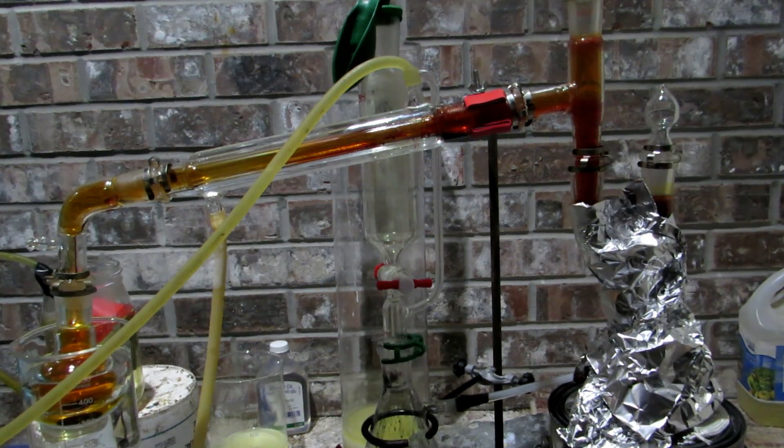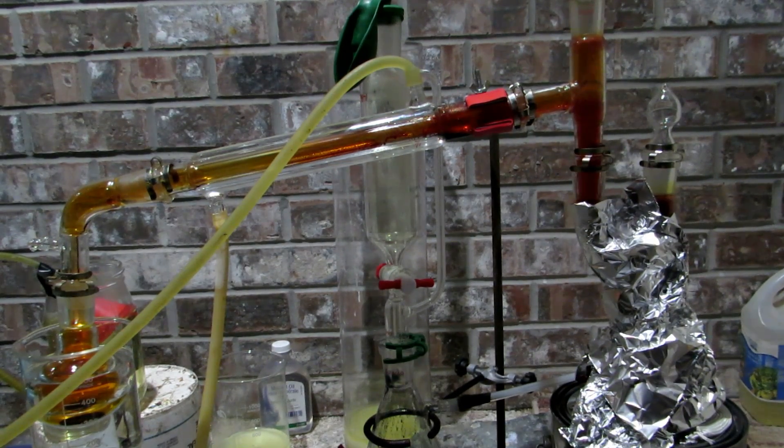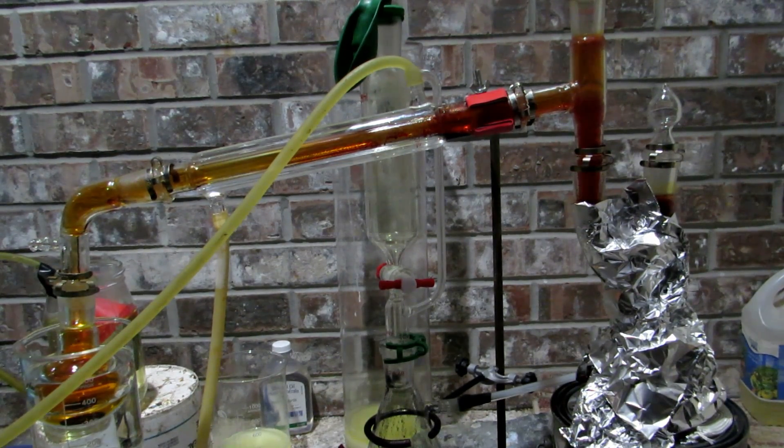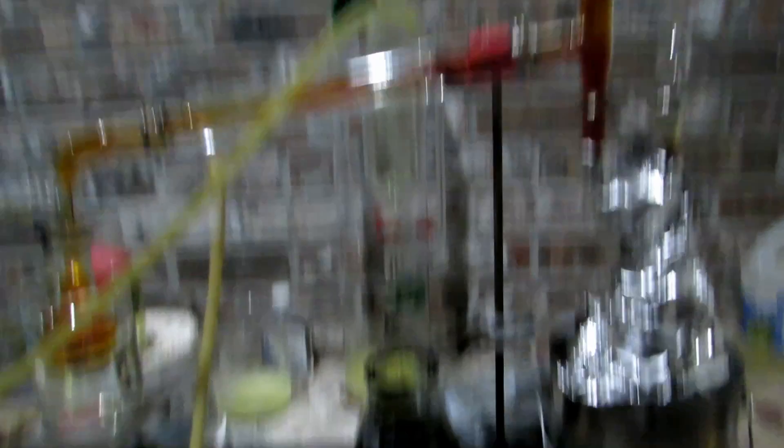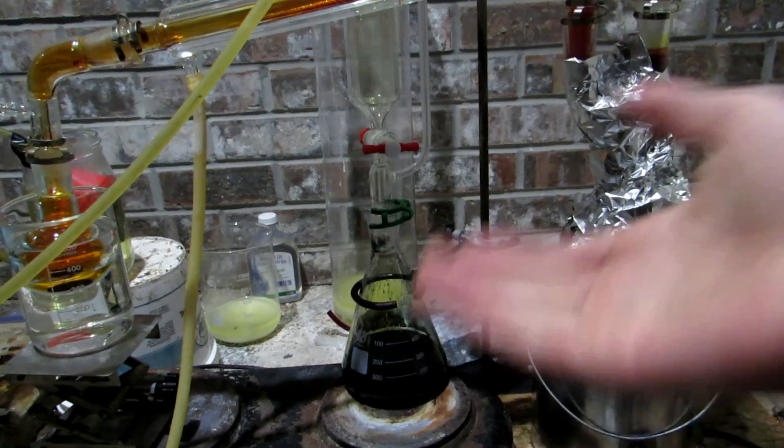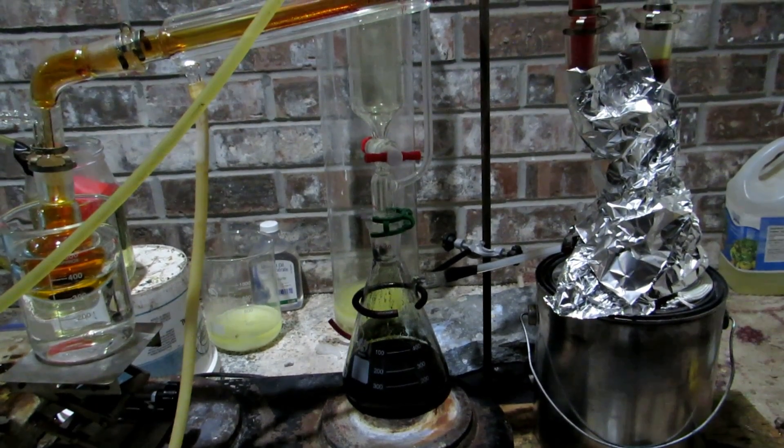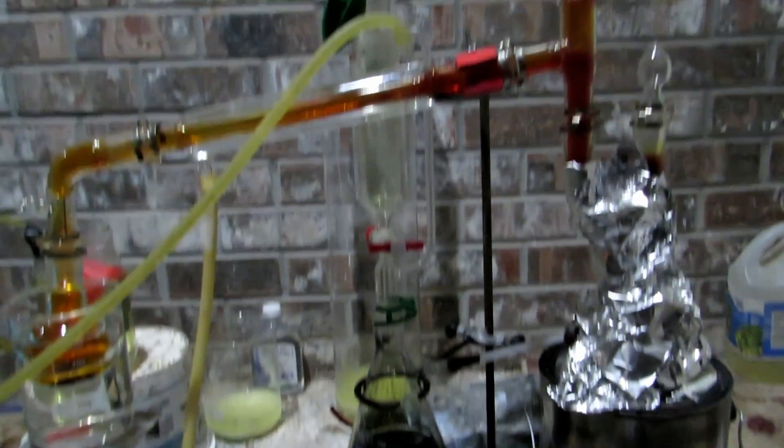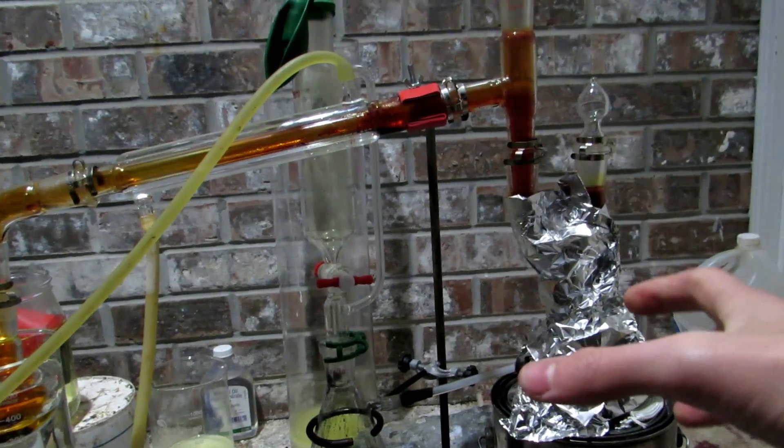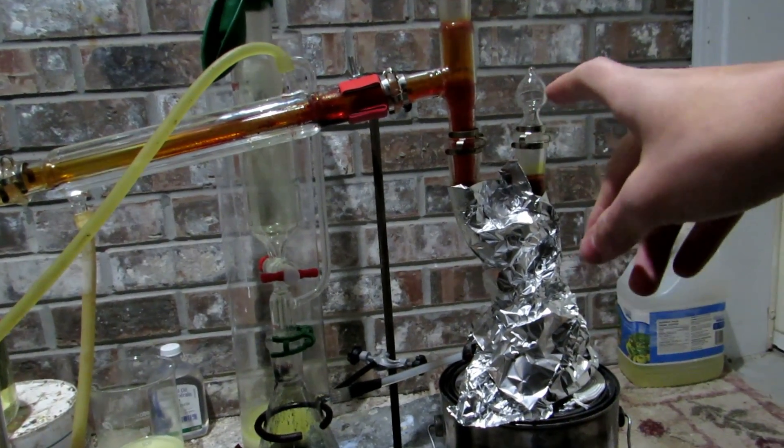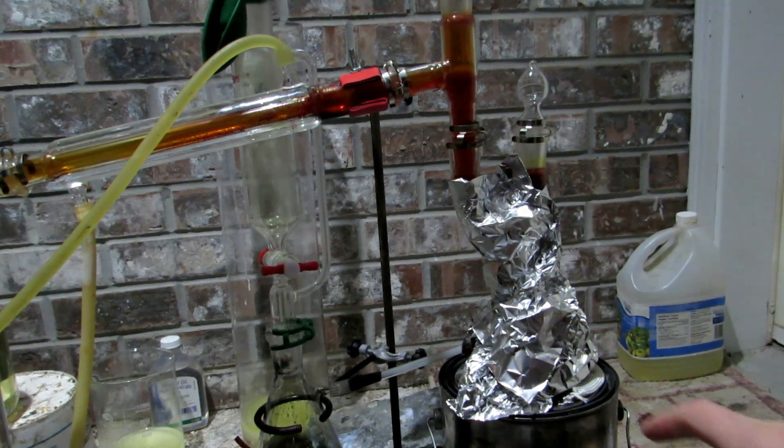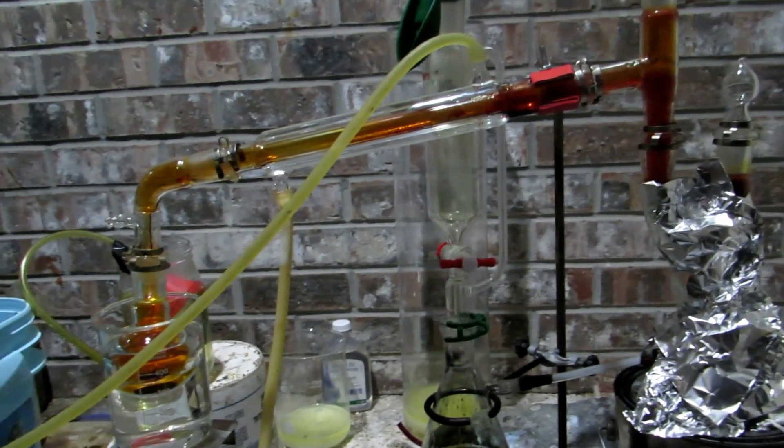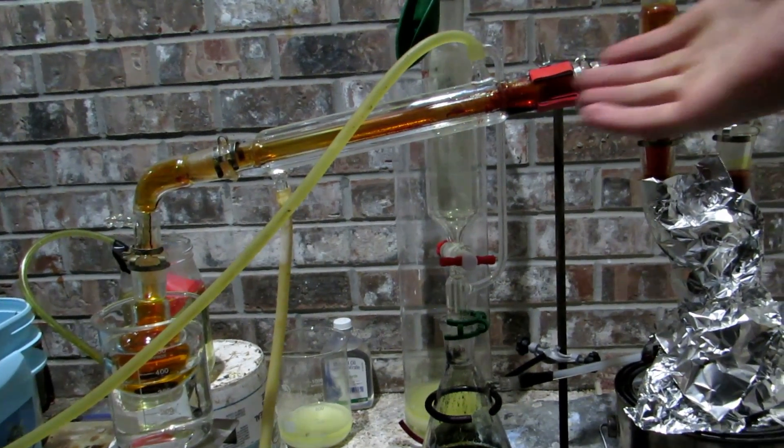Okay so once it looked like all the potassium bromide more or less reacted the chlorine gas generator was taken apart and also stopped producing chlorine gas. A piece of aluminum foil was placed around the apparatus and the place where the tube went in before was replaced with a stopper. The temperature was then ramped up on our heating mantle here and you can clearly see we are now distilling bromine.